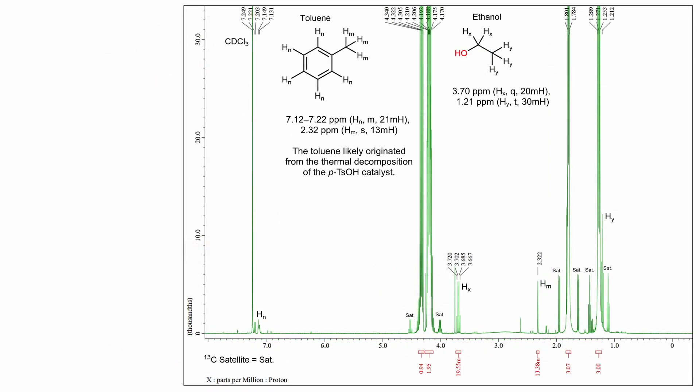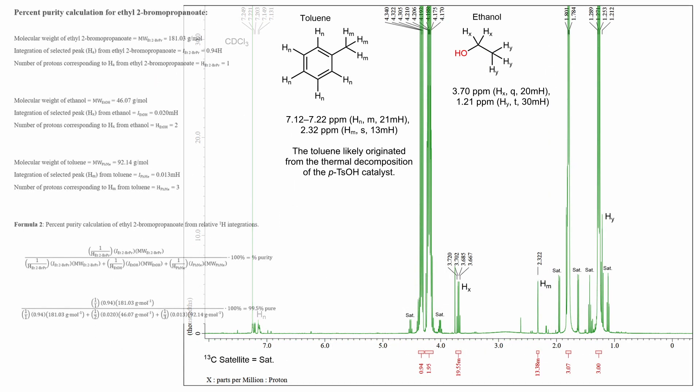Most of the smaller peaks around the baseline can be attributed to carbon-13 satellite signals. Although it can be seen that there is also a very small amount of ethanol, as given by the presence of a quartet at 3.7 ppm. And based on the integration value of this peak, it shows that there is 0.3% ethanol contamination by weight.